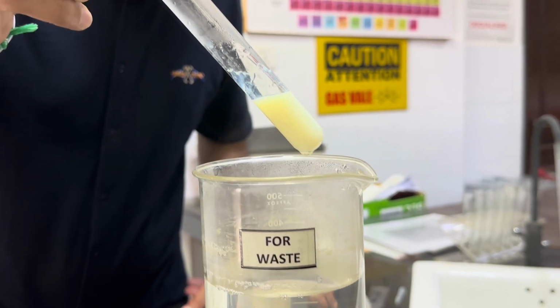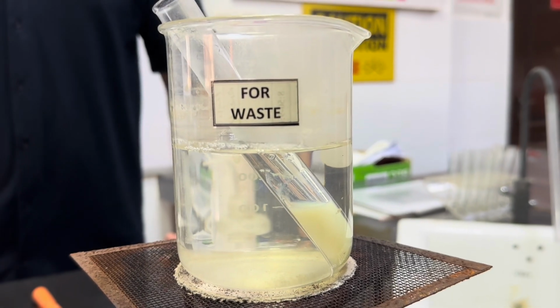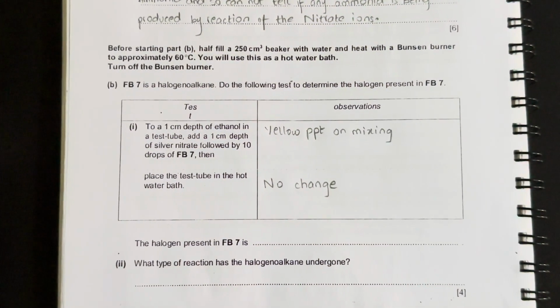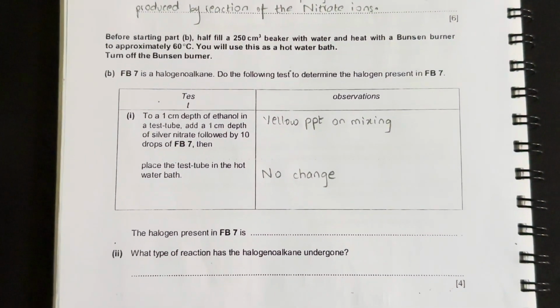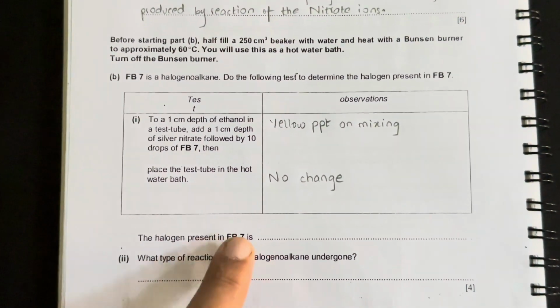So no change is happening to the yellow precipitates. So we will record this observation here. So we have recorded the observations here. Now let's proceed on to the next part, which says the halogen present in FB7 is.